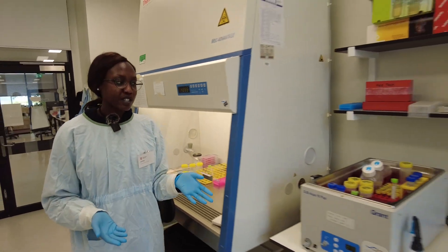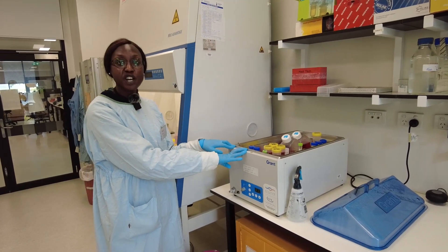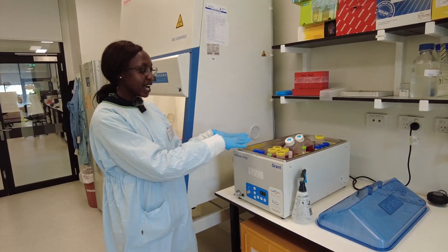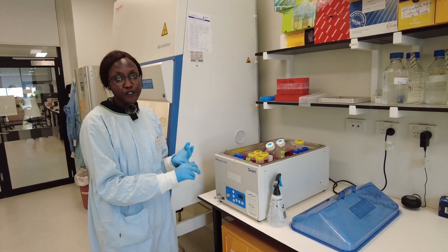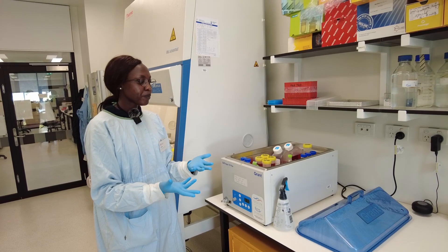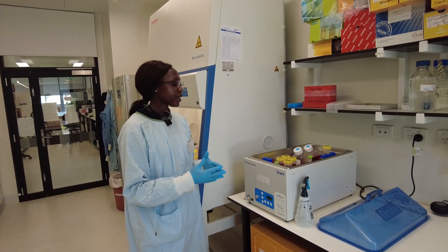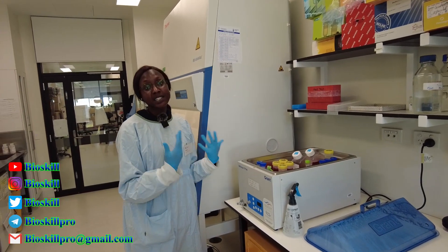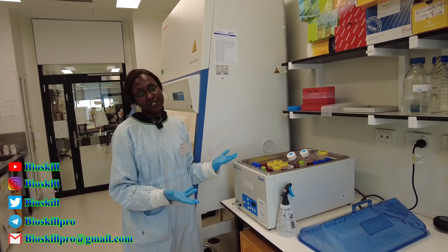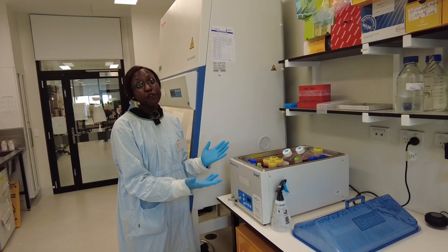Another equipment that we use is the 37 degree water bath, which is also the same temperature as the incubator. Inside this, we warm up everything that we're going to add to the cells, like the media, fetal bovine serum which we need to make media, our penicillin or antibiotics, as well as all of our treatments that we're going to add to the cells. Everything needs to be at 37 degrees and this gets renewed or refreshed every week.